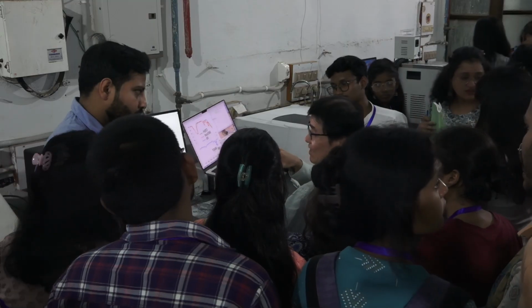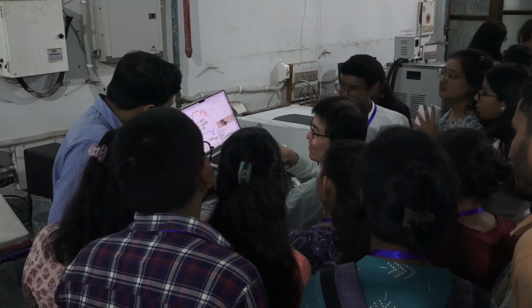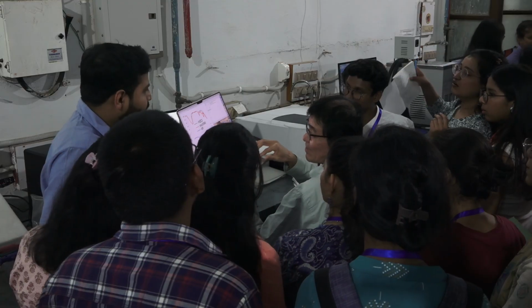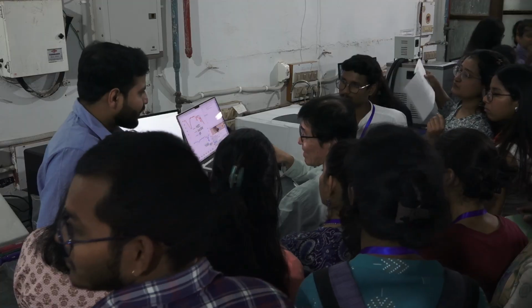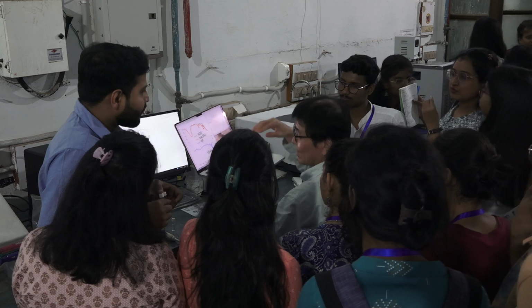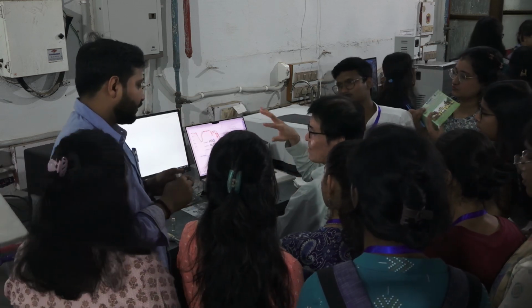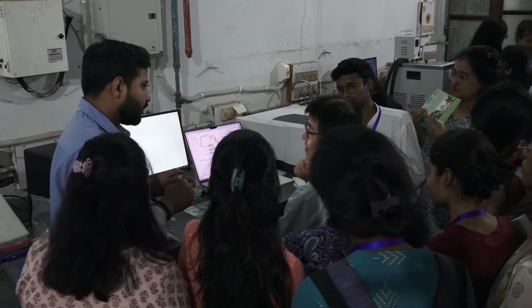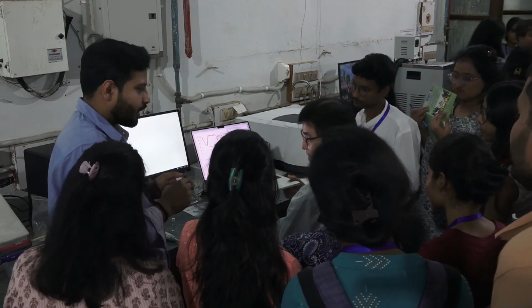Actually, I'm not satisfied, because blue is a difference, and in the vertical axis the baseline is 0 and the peak is negative. But in principle, the baseline should be 100%. So we need to be careful about this operation. I will set an offset to make the baseline 100. Then it makes sense. But I think this kind of graph can be made using any data analysis software. So please try it.